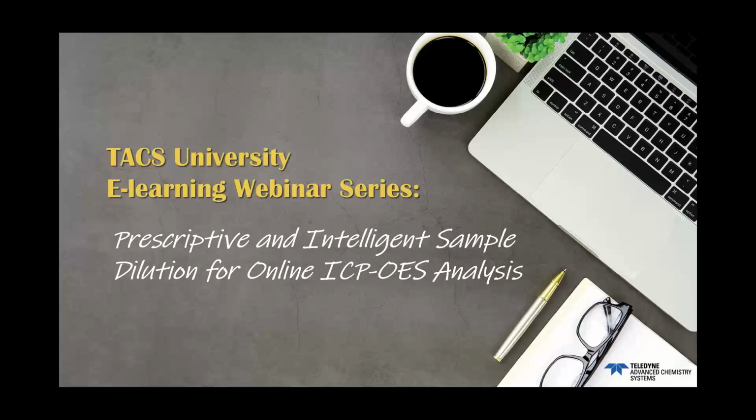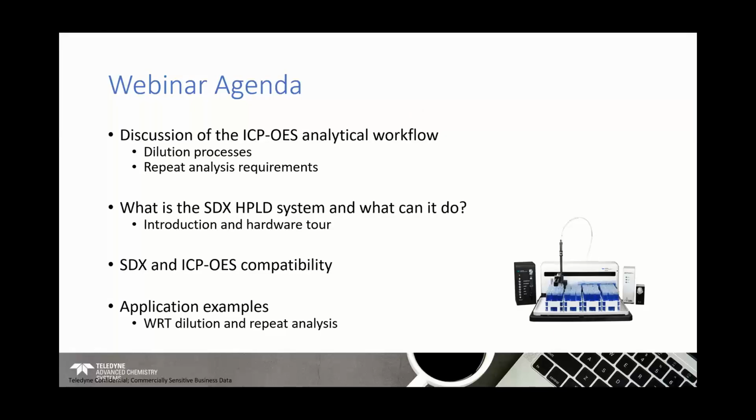So just to start, I wanted to set out a quick agenda to walk through what I'm going to be describing today. Firstly, I wanted to discuss what we call the analytical workflow. This is a workflow that can be applied to a lot of different types of analytical technology. In this case, I'm going to be describing it with respect to ICP OES. This is a workflow that I've described on previous webinars, but I'll be going through this as the starting point, the jumping off point for the rest of the webinar.